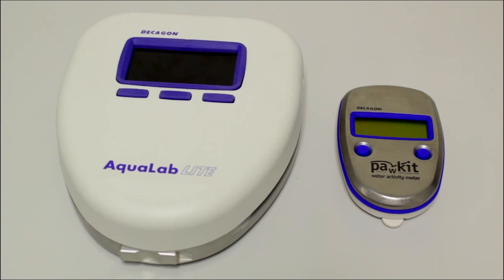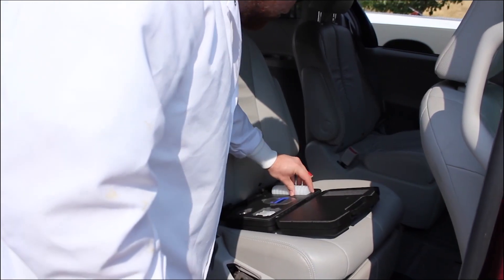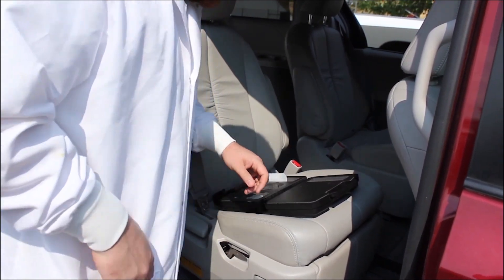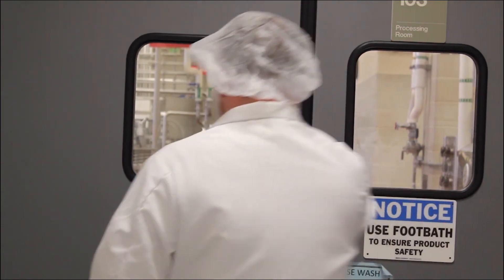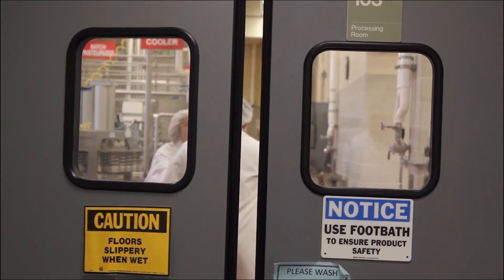This video will show you how to clean, use, and maintain the Aqualab Pocket and Light. Both the Pocket and the Light were designed to be portable water activity meters to get quick water activity readings. It is important to know that these instruments were not designed for use in a lab, quality control, or a research and development setting. This is because of the accuracy of these instruments and other limitations.